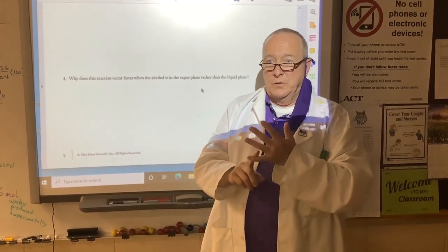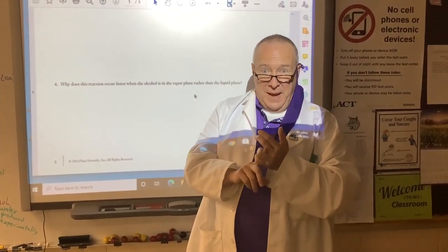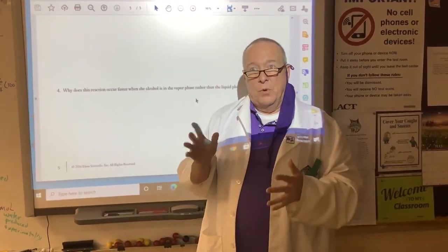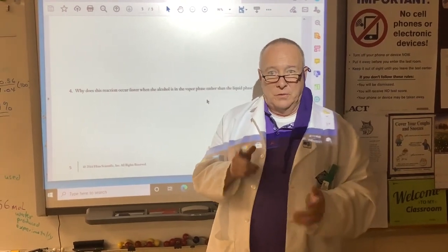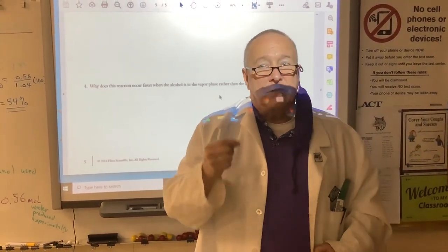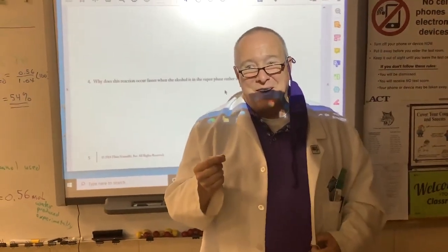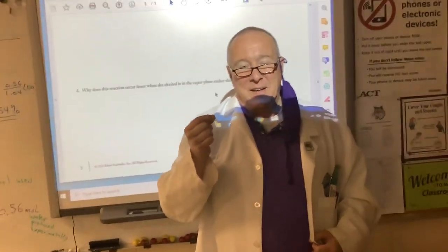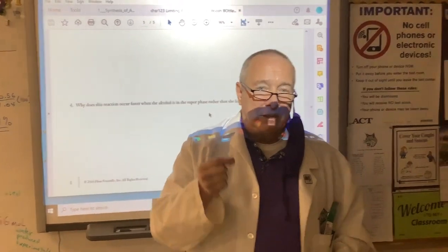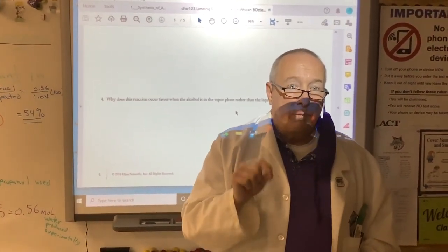So there's your answers. There's your explanation of what happened and your calculations that are expected for this reaction. So we've jumped ahead because I still need to get a video done of our limiting reagent lab where we dissolve the magnesium in the acid. We'll post that video next, hopefully tomorrow.